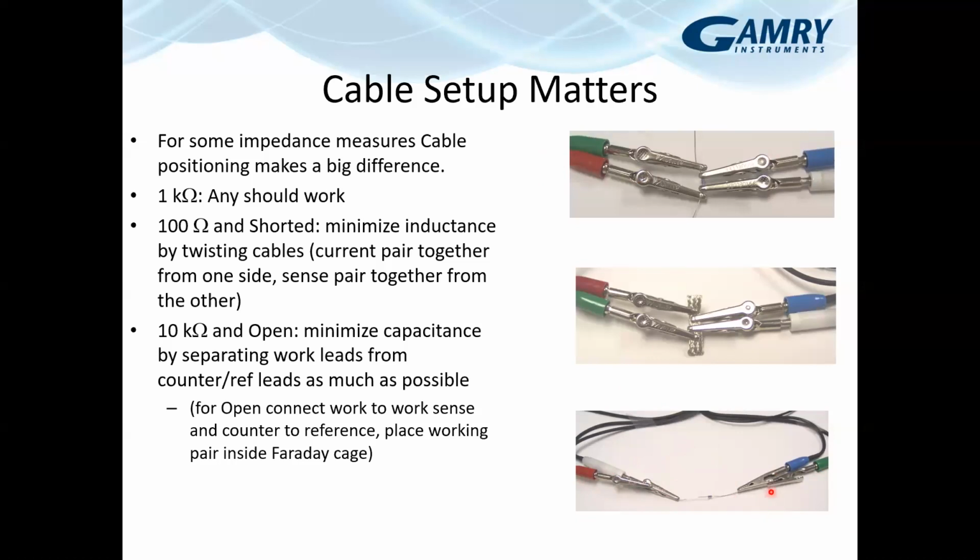If you run them parallel, you add capacitance to your measurement. If you want to measure something that's 100 picofarads, that added capacitance is significant. If you're measuring things that are mostly 10 to 100 ohms at high frequencies and 100 kiloohms up to megaohm at low frequencies, it probably doesn't matter a whole lot. A lot of times you end up being constrained by your electrochemical cell anyway. But in terms of absolutely minimizing the cable capacitance for this measurement, this is how you would set that up.